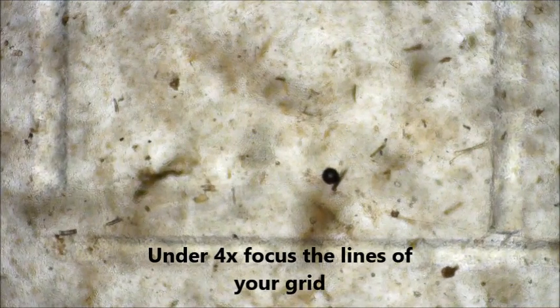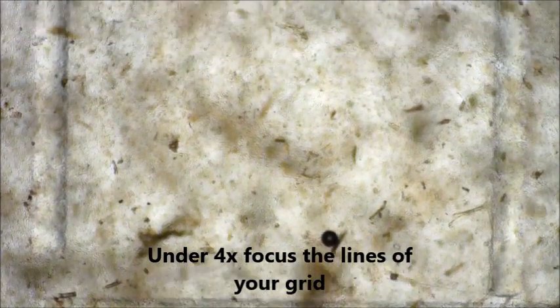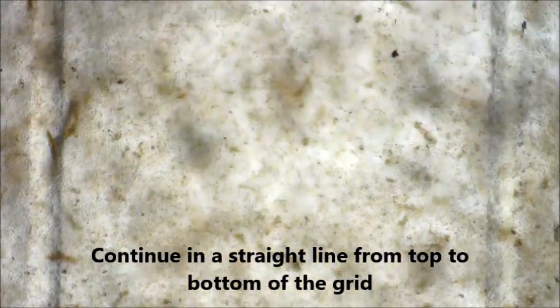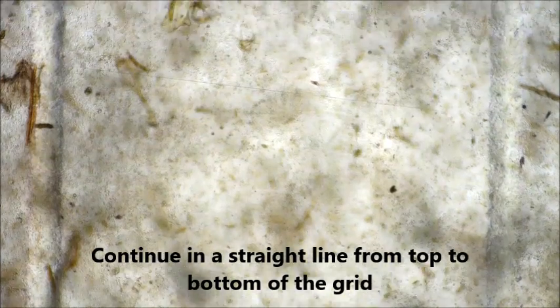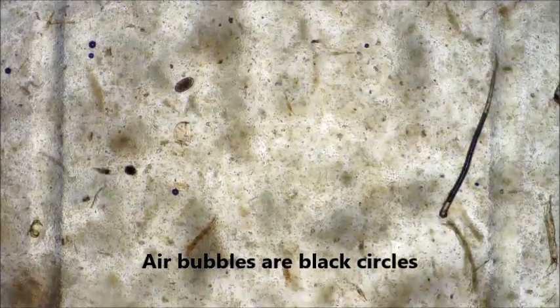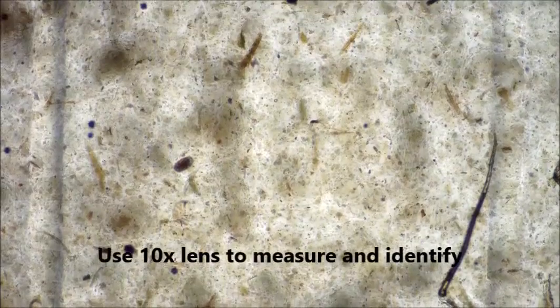Focus your grid lines under your 4x lens and move in a straight line from the top to the bottom of the grid. If you see air bubbles, you know you're in the correct area, as air bubbles also float. Using your 10x lens to identify and measure, count all eggs in both sides of your chamber.